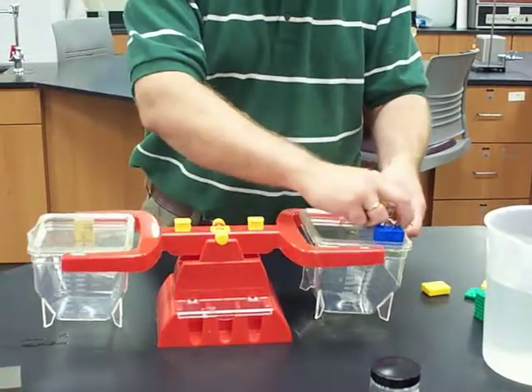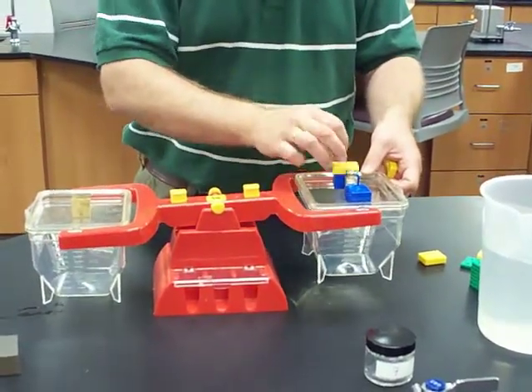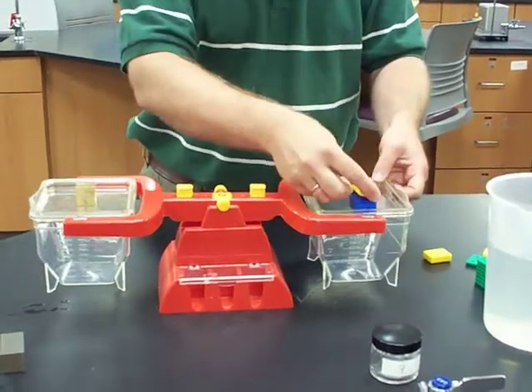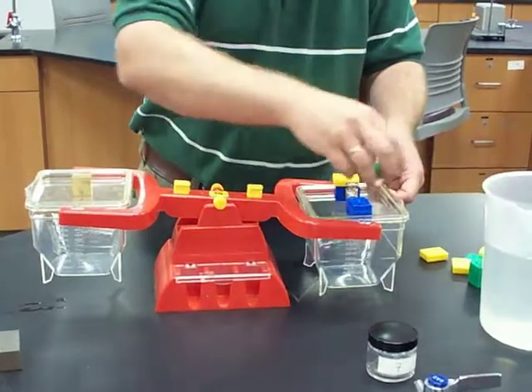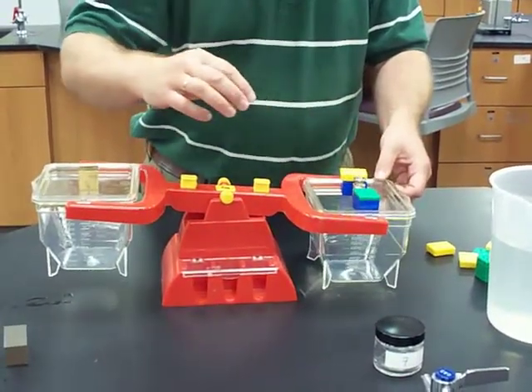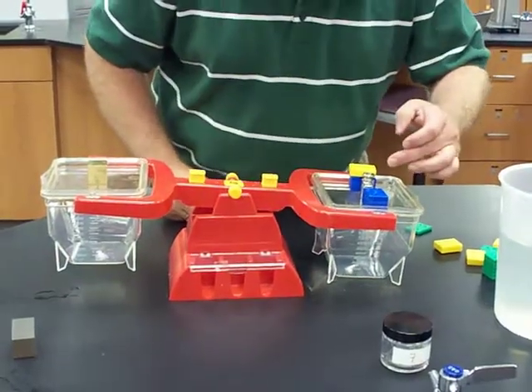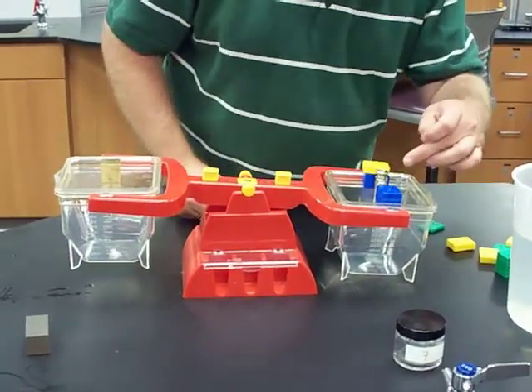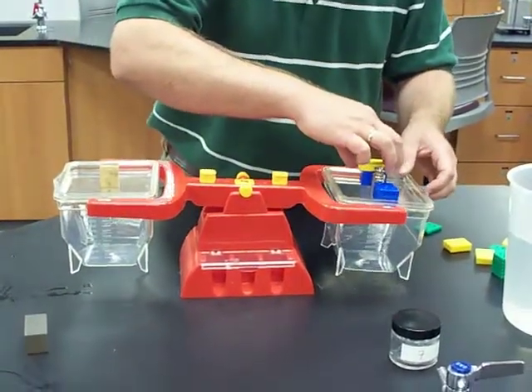That's okay, we just keep taping. And that's actually too much. So where we are, that's still too much. Okay, how much do I have at this point? 90, 110, 130, 140, and that is too much.